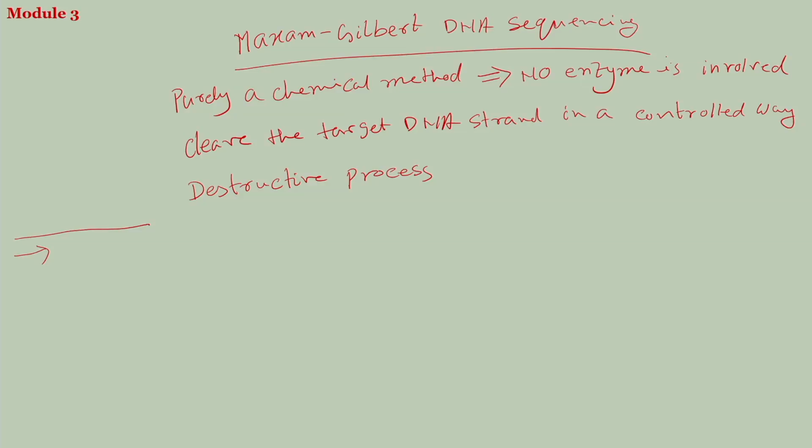It is a destructive process and it is a selective cleavage of the purines and the pyrimidines.